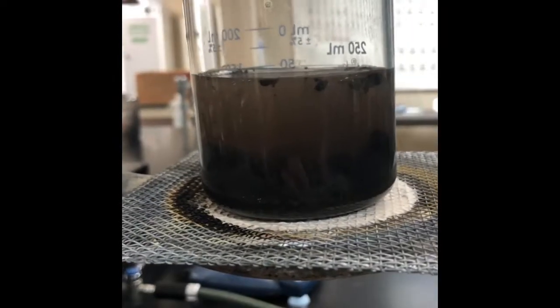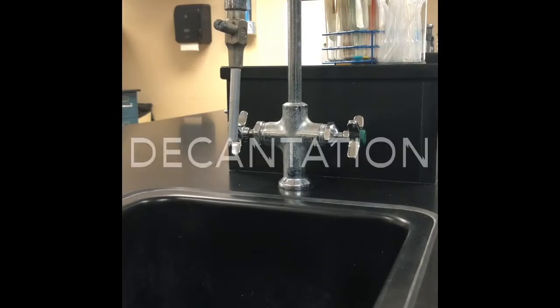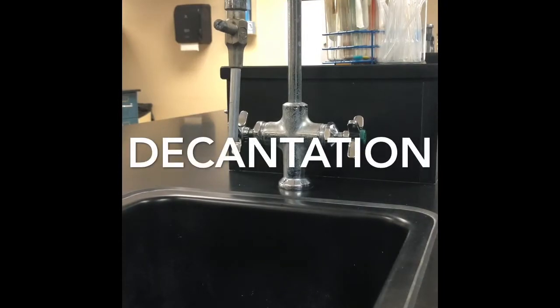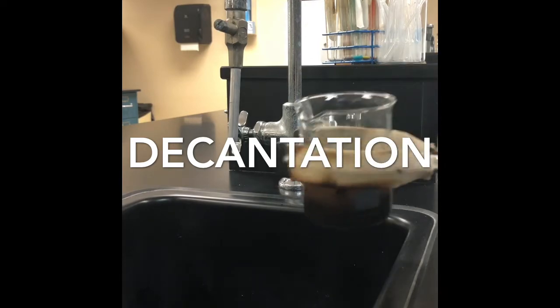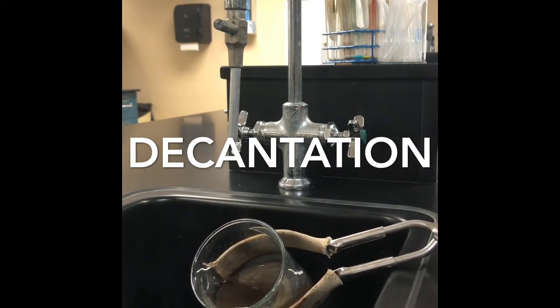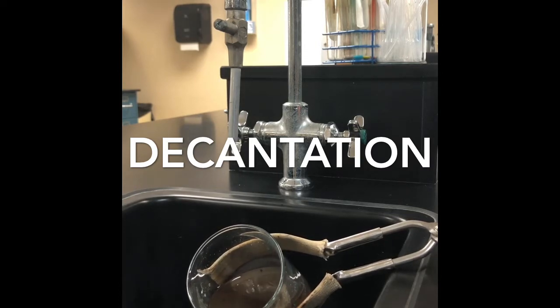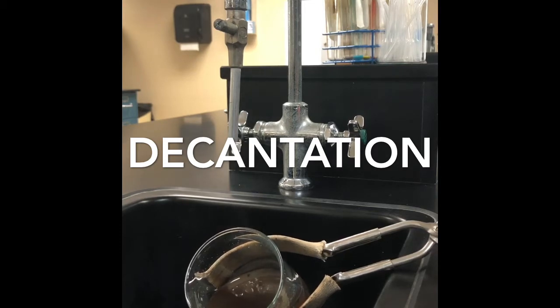So we're going to try and keep all the solid that we can, and we're going to pour off the liquid. The next part of the lab says that we need to let our mixture settle. You can see that the solid is collecting at the bottom, and what we're going to be doing is pouring off the liquid. Okay, that's called the supernatant liquid. So I'm going to attempt to do this the best that I can with my camera and my hands and trying to pay attention to what I'm doing. So I'm going to pour off the liquid very, very slowly in an effort to keep as much of the solid in the beaker as I can, because that's going to be our product. And most of that solid is collected at the bottom.